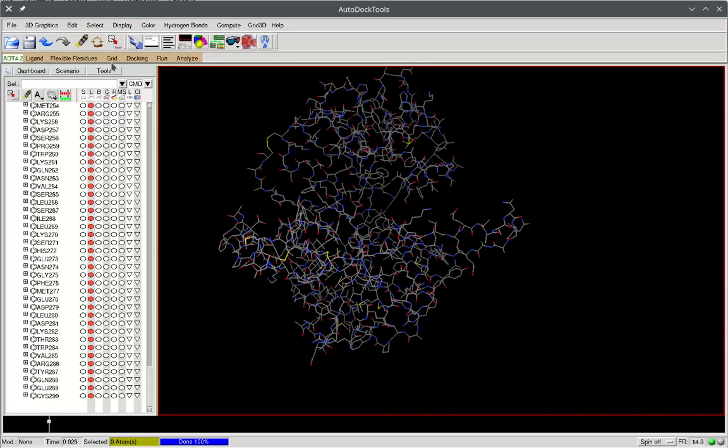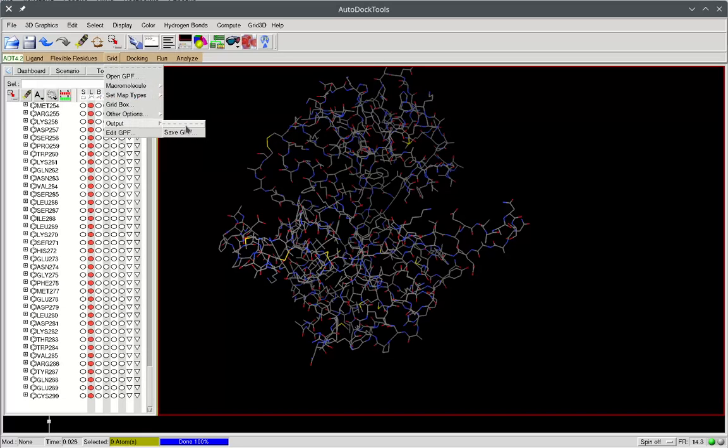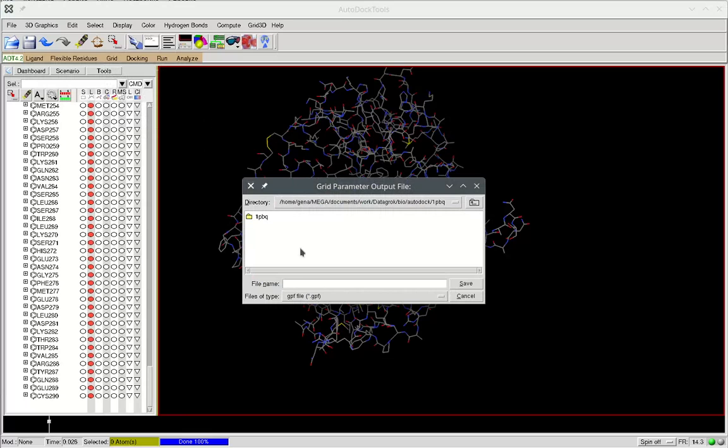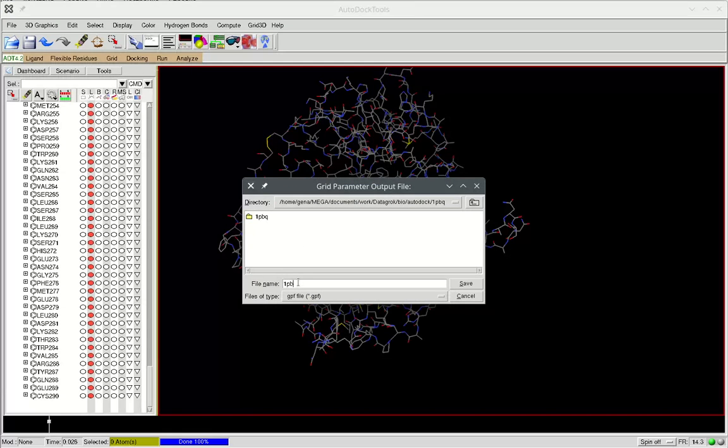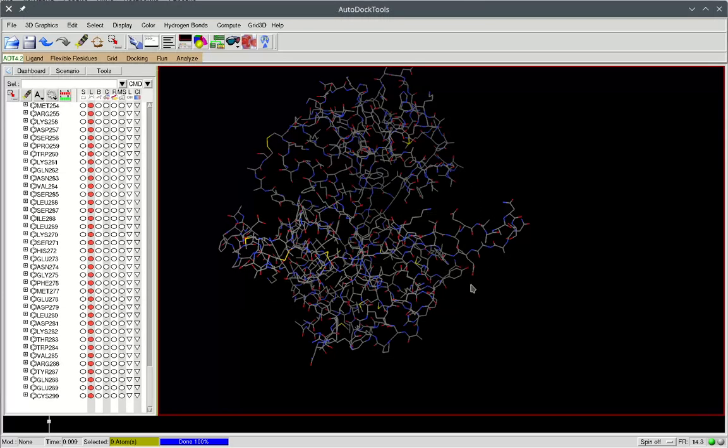After this we go to Grid Output and we save the grid parameter files. It should have the same name as the molecule itself, so I'm choosing 1PBQ GPF. Okay, that's it.